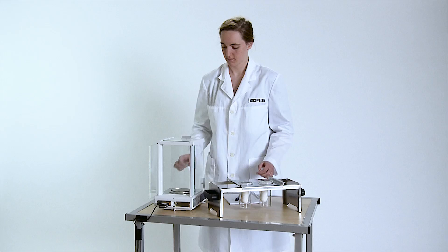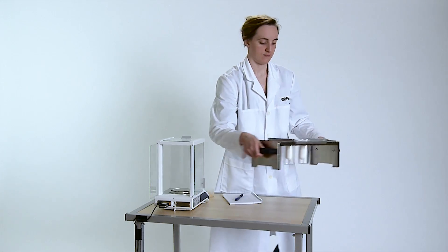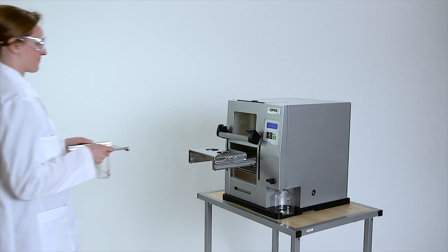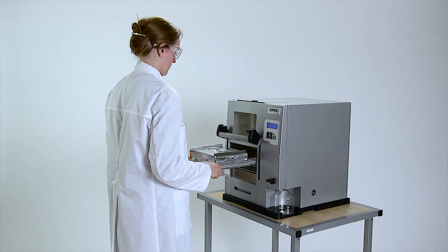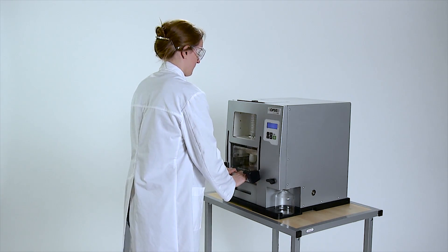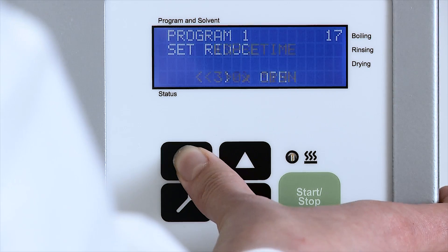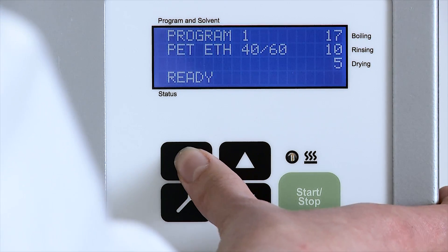A unique feature with Soxrock is the easy handling of the rack. It is a simple task to place the samples and make sure that the instrument is completely sealed. The user-friendly interface ensures easy adjustments and a quick start of the process.